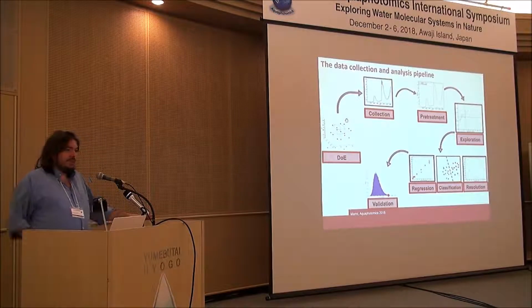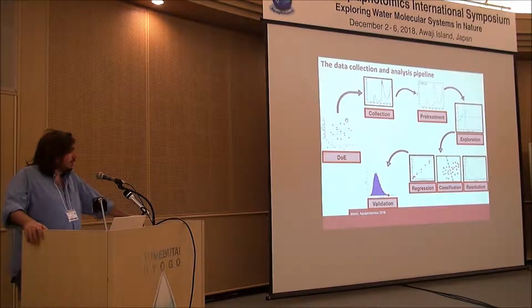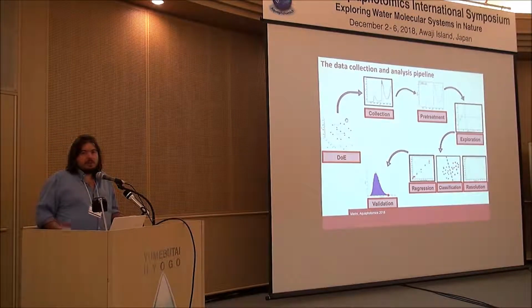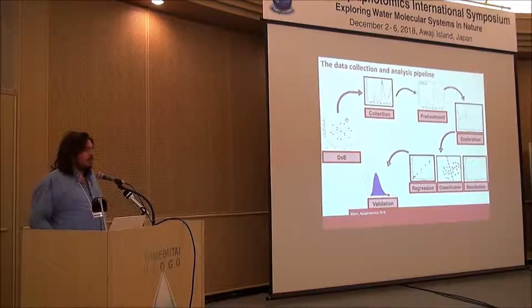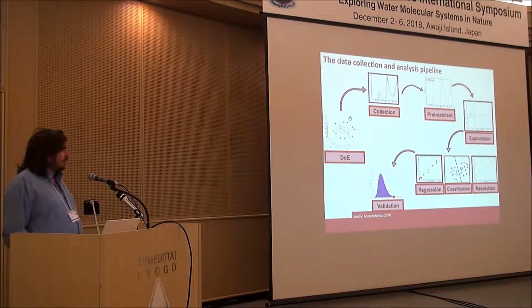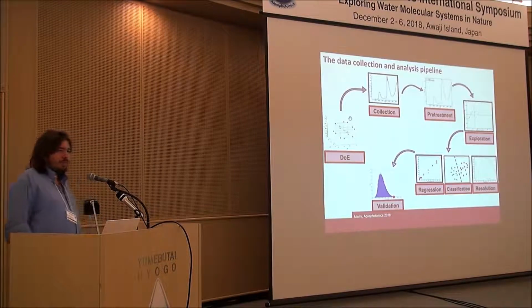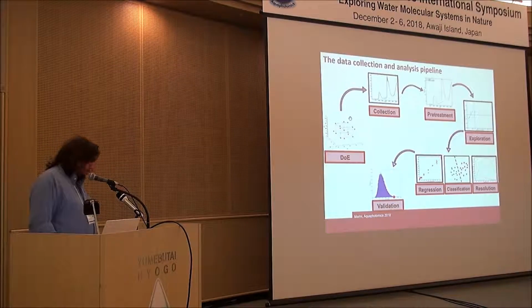further additional possibilities, and I wouldn't say these are the only ones, could be those of trying to do resolution of the data, meaning that we want to start from the experimental data and extract profiles that summarize the variability in the data that is chemically or spectroscopically relevant, or some sort of supervised modeling that may be for qualitative variables, and in this case we would speak of classification, or quantitative variables, and in this case we would move into the realm of multivariate calibration or regression.